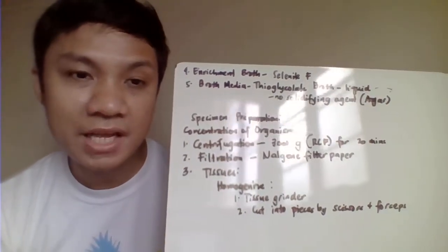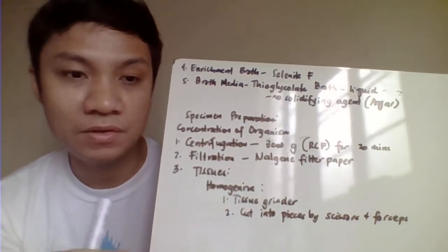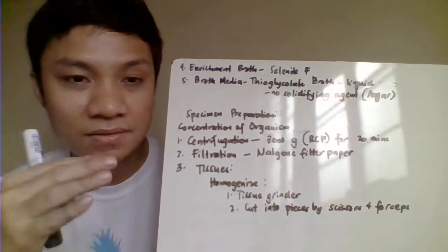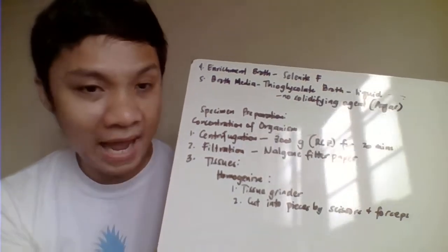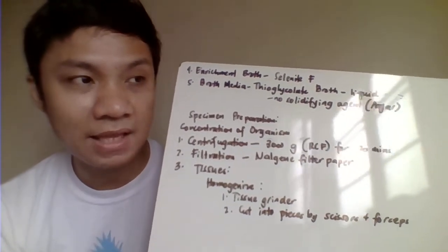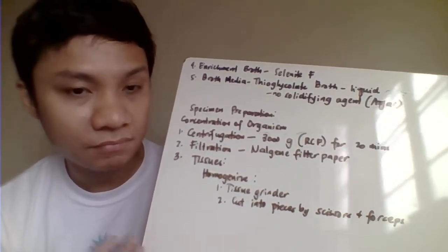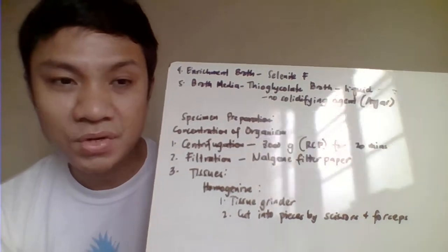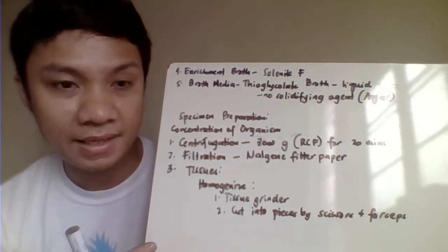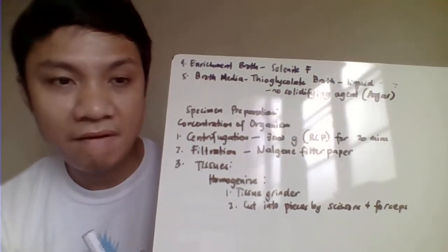After centrifugation, your microorganisms settle at the bottom. They become your sediment. Decant, then collect the sediment. That is what we plate, or inoculate, onto our culture media. Thus, this gives you a higher chance of recovering your bacteria.